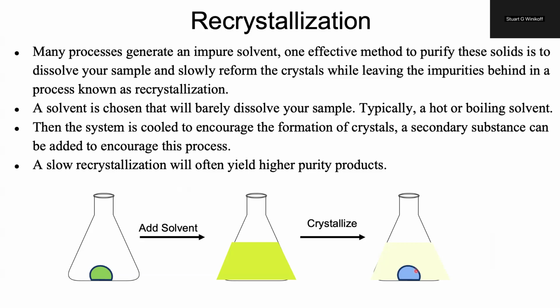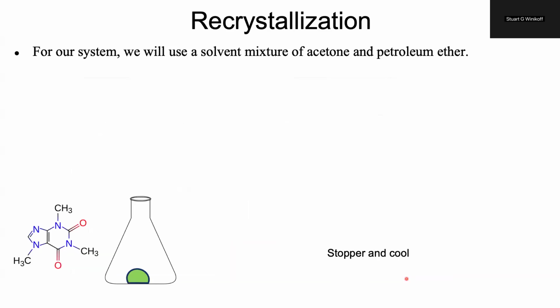it should make sure that the only thing present in the crystals is my substance. Because if I do this process nice and slow, any impurities should be left behind in the relevant solvent. But again, because I don't want to leave much of my solid behind, I'm going to make sure that I use as little solvent as possible to guarantee that only a minimal amount of my desired product is left in solution.